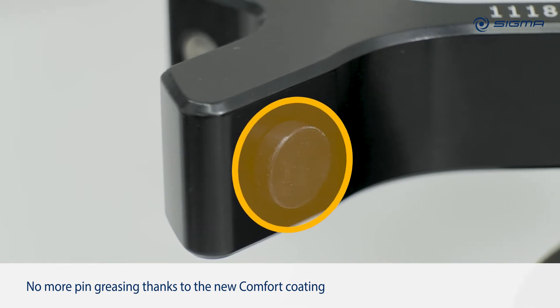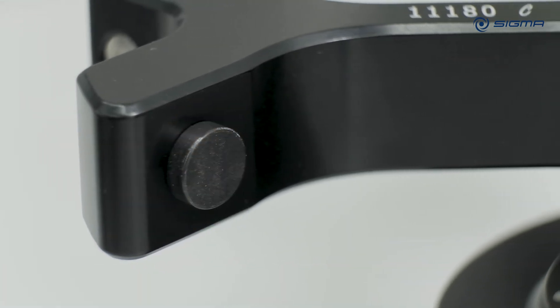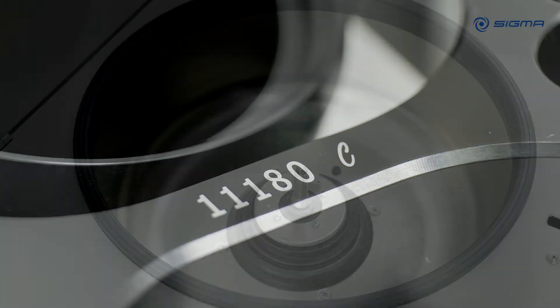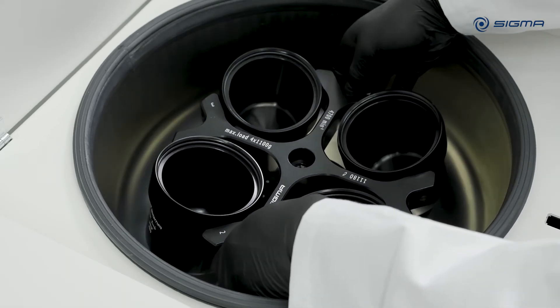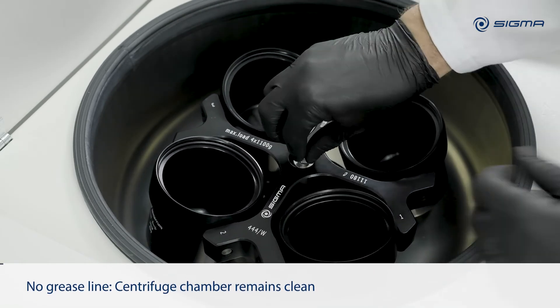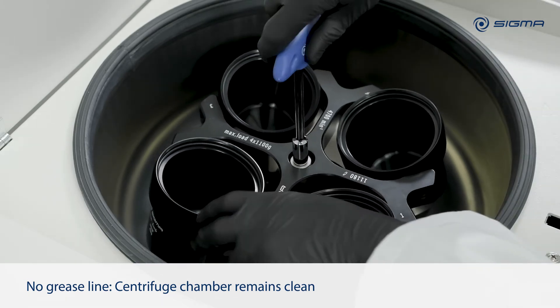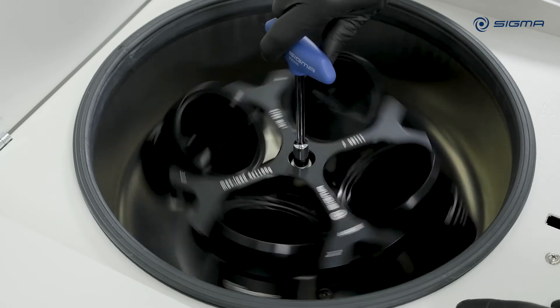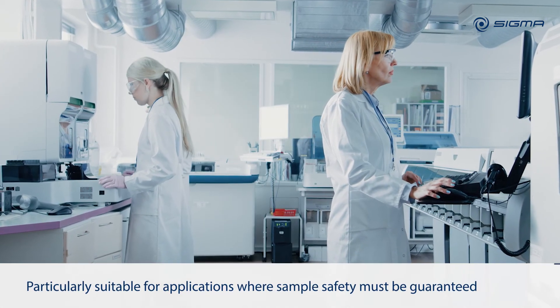Thanks to the new comfort coating, it is not necessary to grease Sigma comfort rotors any longer. Rotor and buckets comfortably operate together for several years without the need of regular greasing. The lifetime of the black coating depends on the intensity of use and may vary. To maximize the lifetime of the Sigma comfort coating, load the rotor always with the same buckets, preferably at the same position.